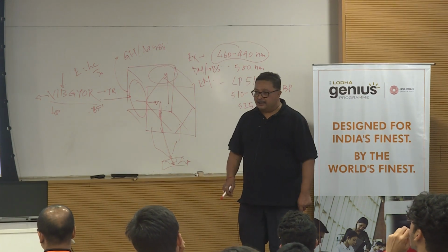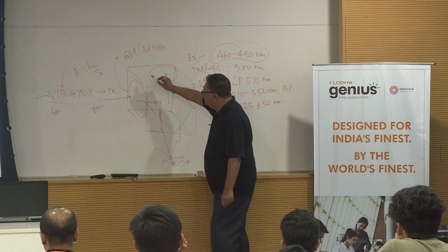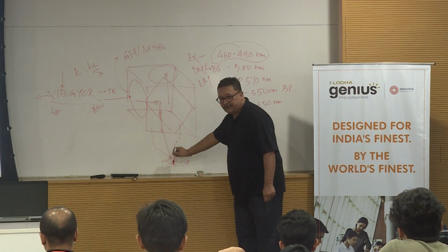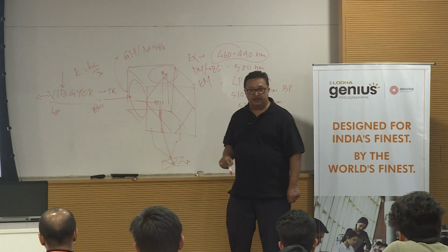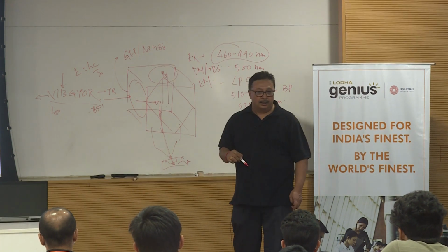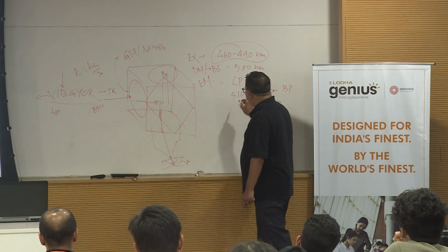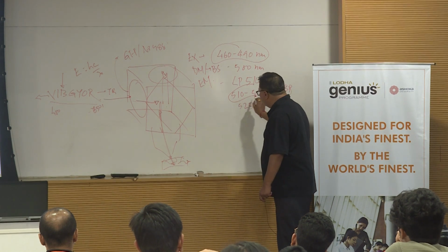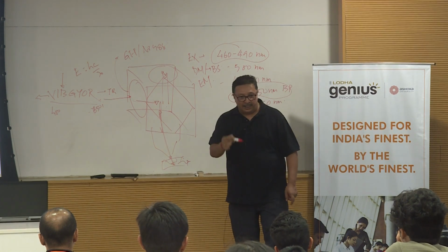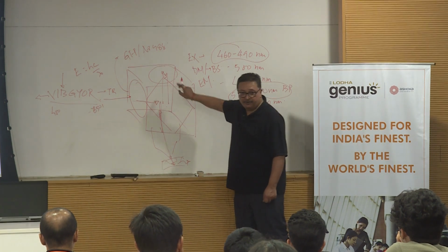So the splitting is lesser than 500, higher than 500. Lesser than 500, 460 to 490, means excitation light. Anything higher than 500 will go into the emission side, that is your emitted signal, lower energy or higher wavelength. And typically, anything from 510 to 550 nanometer is only allowed to pass, because this filter has that specification.